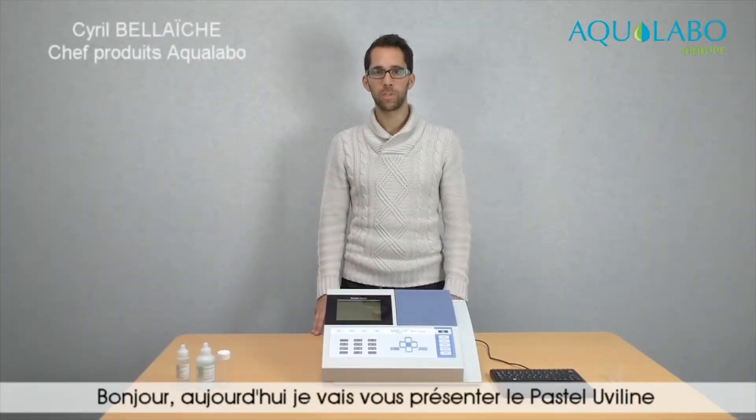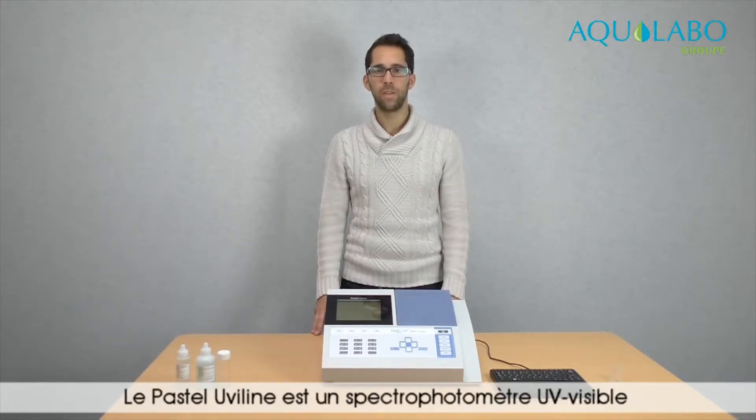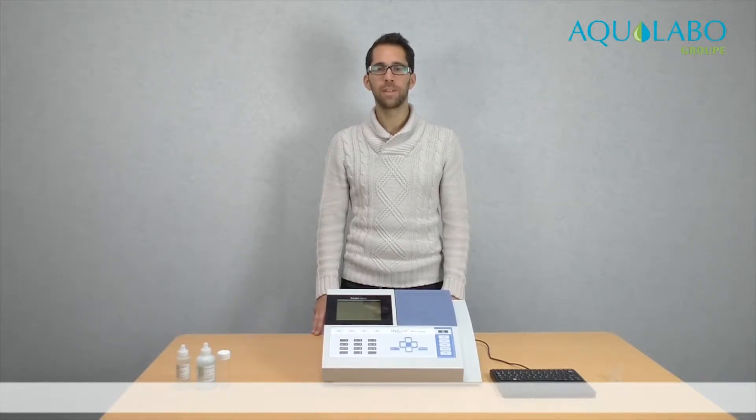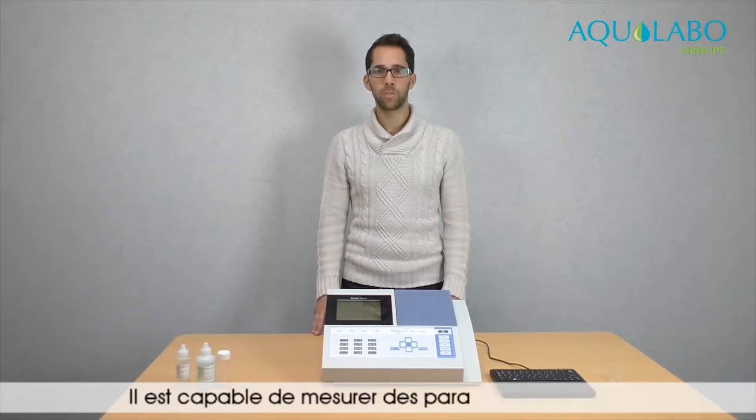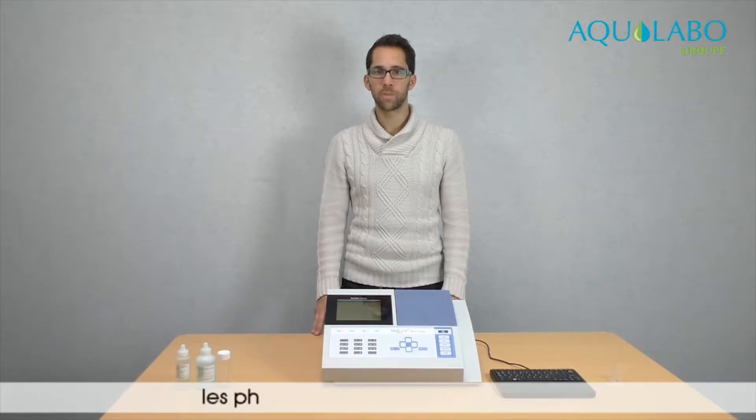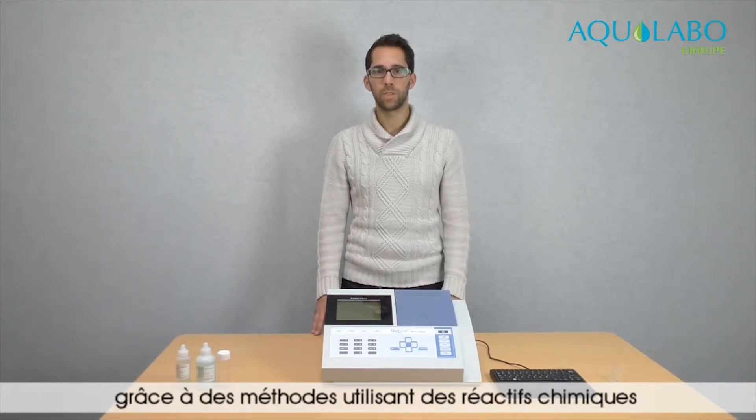Hello, I am going to present you the Pastel UV line. The Pastel UV line is a UV visible spectrophotometer dedicated to wastewater analysis. It is able to measure parameters such as phosphates, nitrates, and ammonia, thanks to methods using chemical reagents.